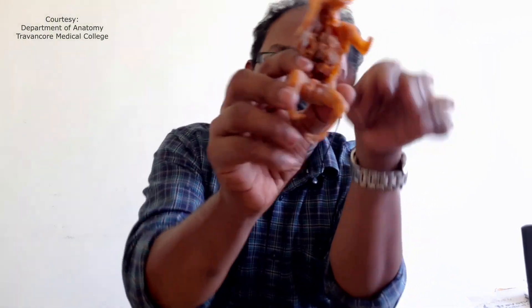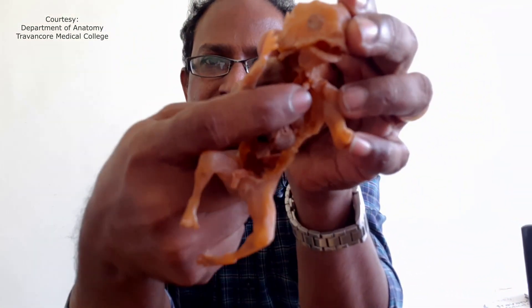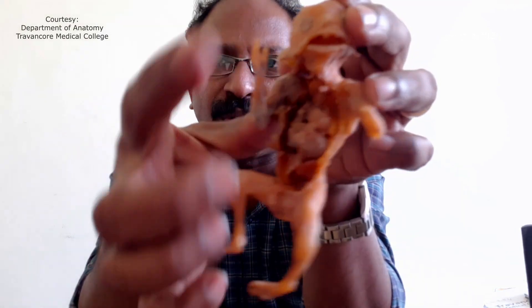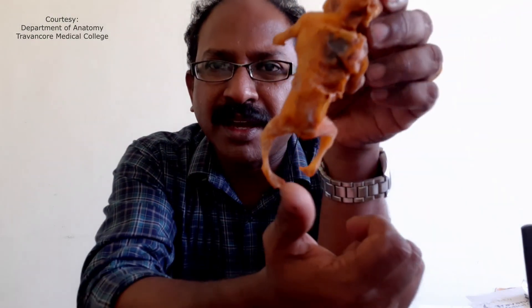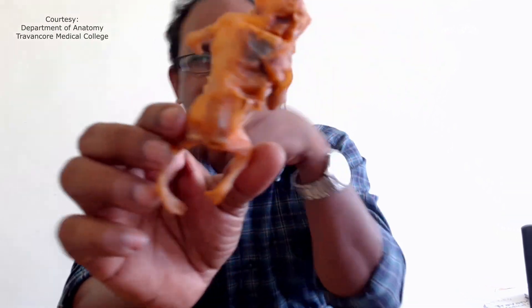Obviously this is not the quality of the plastinated specimen which I am looking for. The internal organs have deteriorated, they have broken off, and there is a huge discoloration on the back. You cannot differentiate between the muscle and the skin — this is not the plastination which I am going for.